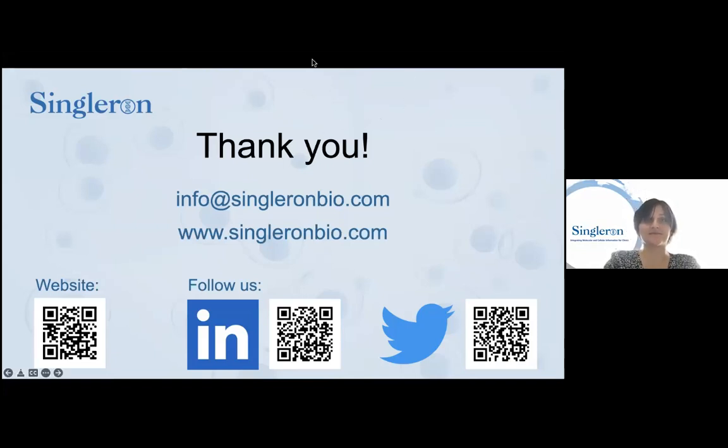Yes, thank you, Dr. Pankova, for the very interesting talk. So I think we could start the Q&A section, and we already have some interesting questions, and I would like to have this webinar be as interactive as possible. So please feel free and ask your questions. The first question is, is there any difference in cell capture efficiency and performance between manual and automated loading using Matrix instruments?